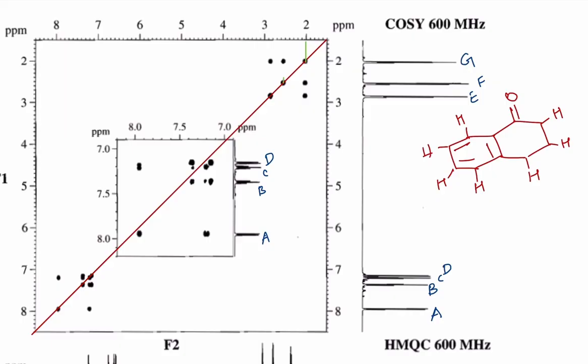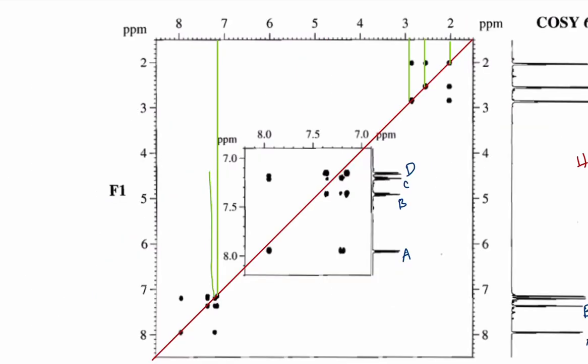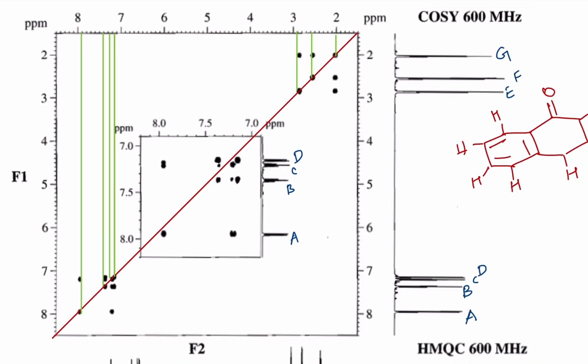I'm going to take the points from the central diagonal, and then go across to the x-axis. Okay, that's how best I could draw.